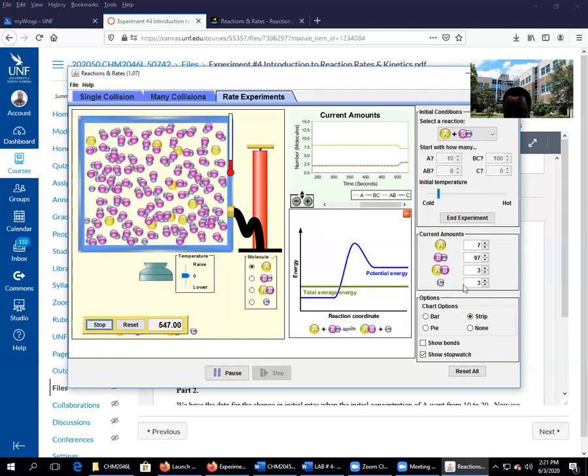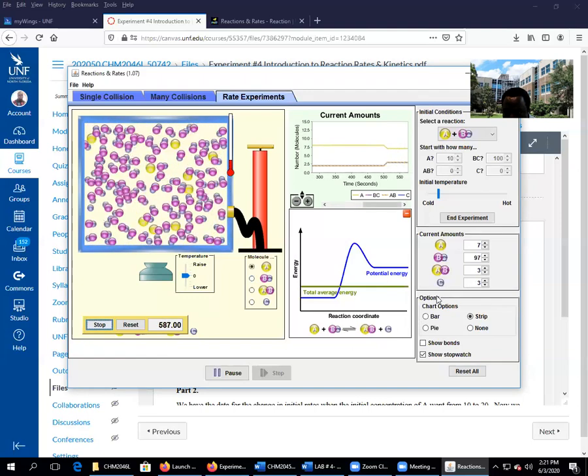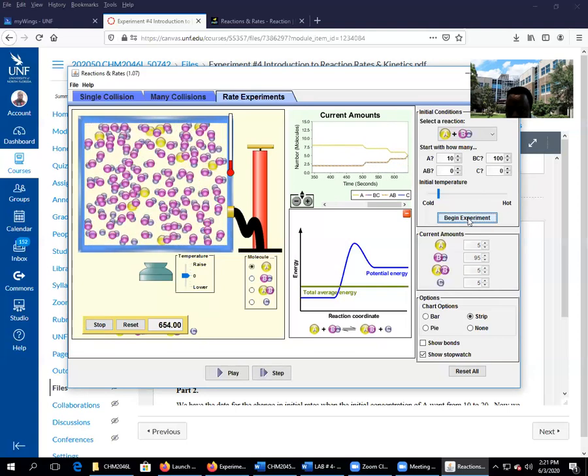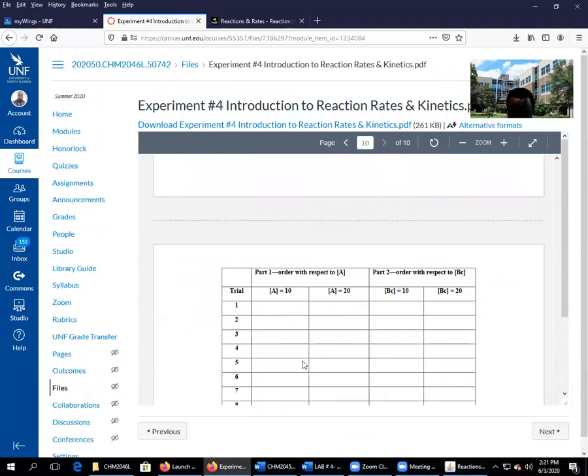It is at 3 right now. It's at 4 right now, so I should be ready. 5, yes, I stop. This is the stopwatch. This is the time on the stopwatch I'll record on the data sheet, right here.